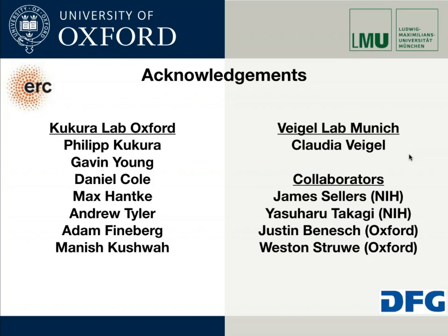And there's another more specific question that came in during your talk. For hetero-oligomerization experiments, like the one that you showed for HSPB1 and HSPB5, is there a requirement on the range of dissociation constant of the hetero-oligomer for mass photometry to work? I think that's a general question in a sense. I don't think there are particular restrictions when considering hetero-oligomerization, in the sense that the method will detect whatever oligomers are there. It's independent of what the mode of oligomerization is. It just measures mass.